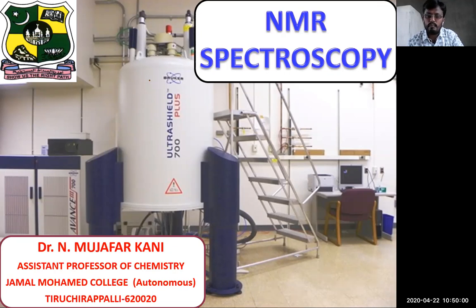Now we want to know the nuclear magnetic resonance spectroscopy. Nuclear magnetic resonance spectroscopy is an important analytical tool to elucidate the structure of organic compounds from H1 and C13 NMR spectroscopy. We want to study the nature of hydrogens and the nature of the carbon skeleton respectively. When a low energy radio wave interacts with a molecule, it can change the nuclear spins of some elements, including hydrogen and carbon.